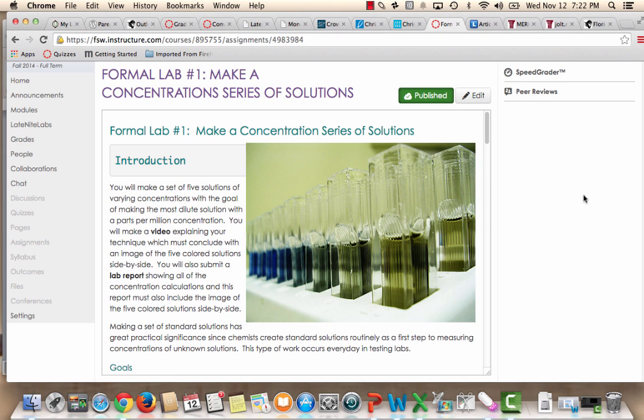Hi everyone, the purpose of this video is to get you ready for the formal lab number 1. You'll have 2 weeks to complete this lab, and I am starting you a week ahead of the lecture class, and so to help you get started, I'm going to go through what is a solution, what is molarity, and how do you make a serial dilution.